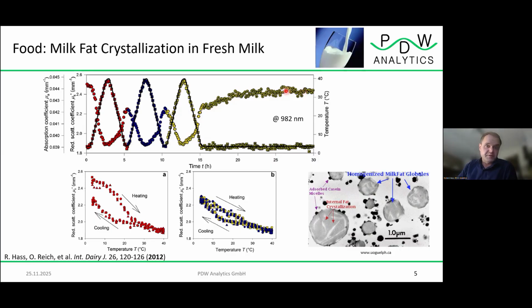And it's just 3.5% fat, so that's not so much material in milk, but it can be nicely observed by PDW spectroscopy. And as I indicated, we can separate between absorption and scattering during such processing.